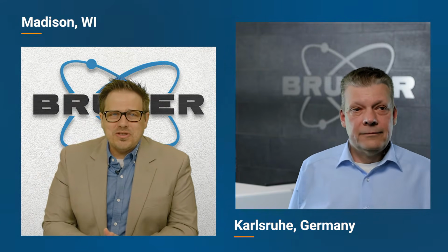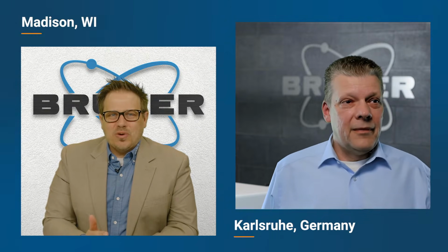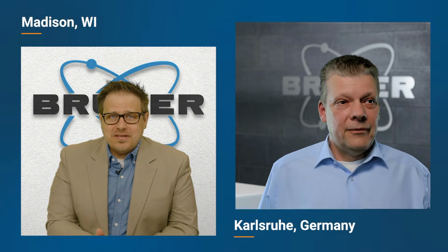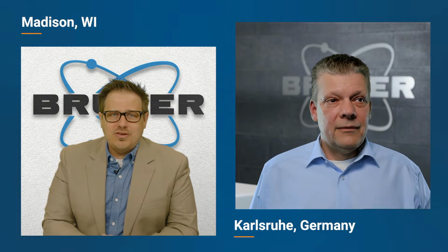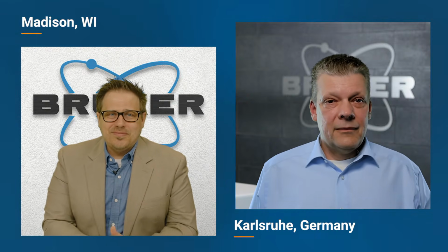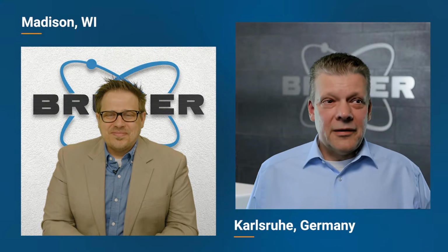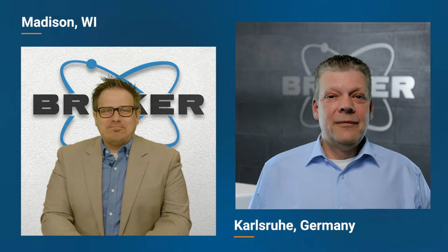All right, so thank you for the great explanations here, Peter. And what we're going to do next now is we're actually going to see some of the scientists in the lab show us how this technique works. They're going to give a demo of a few of the different instruments. And everybody out there, while you're watching it, please make sure to type in any questions that you have, and we will get to them after the lab demo. So thanks again, Peter. Thank you, John. Thank you for a nice discussion that we had. All right, and off to the lab.